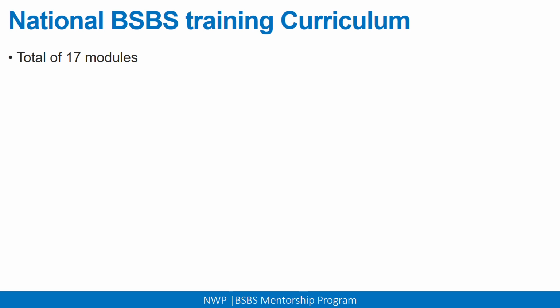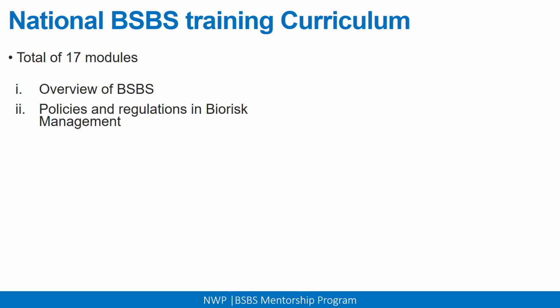So what are the modules? I'll describe them as you can structure them from the first module up to the last module. We're going to have the overview of biosafety and biosecurity, which will give you an overview of biosafety and biosecurity management. Then policies and regulations in biorisk management. Then you have biosafety and biosecurity assessment.